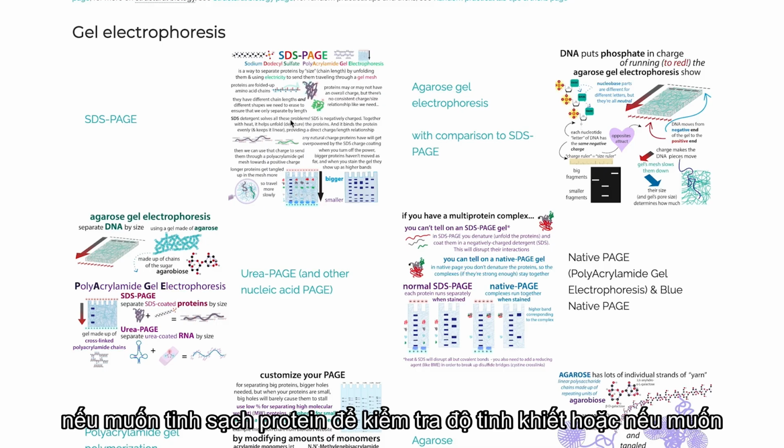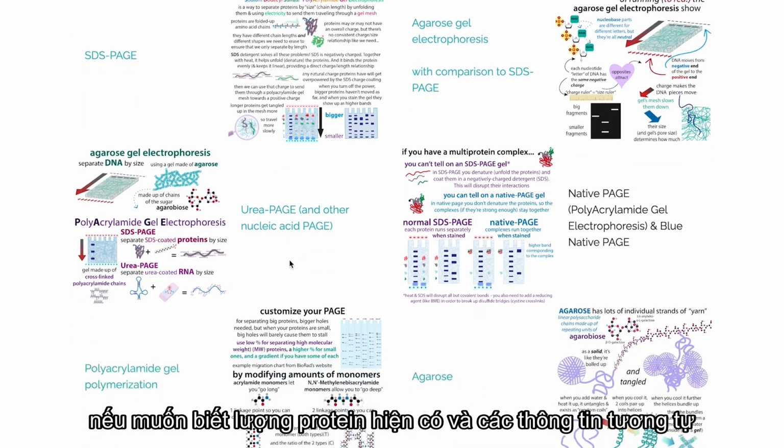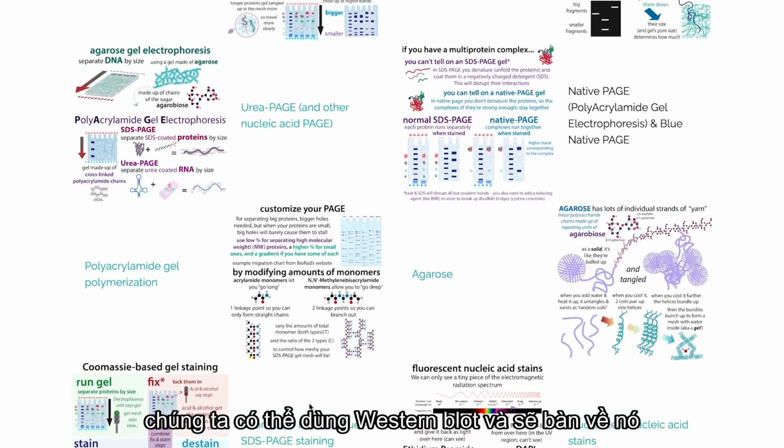If you want to purify a protein to see how pure it is, how much of it there is, we can go to a Western blot, and we'll get into that.